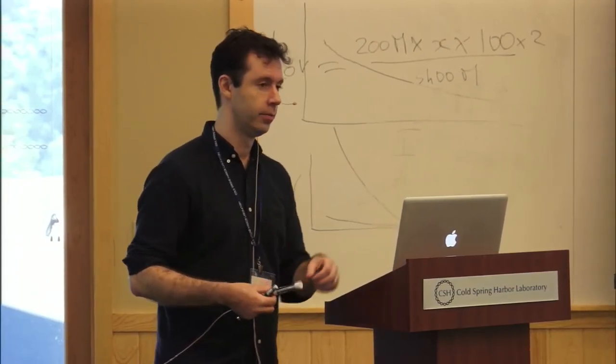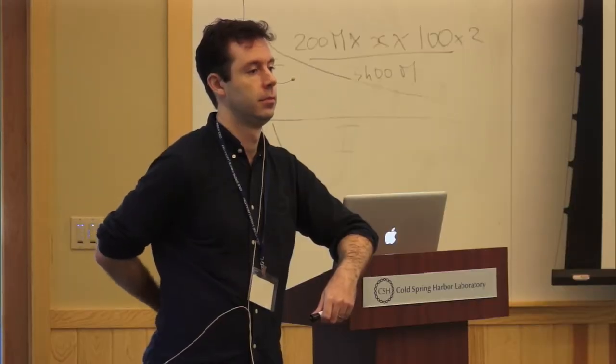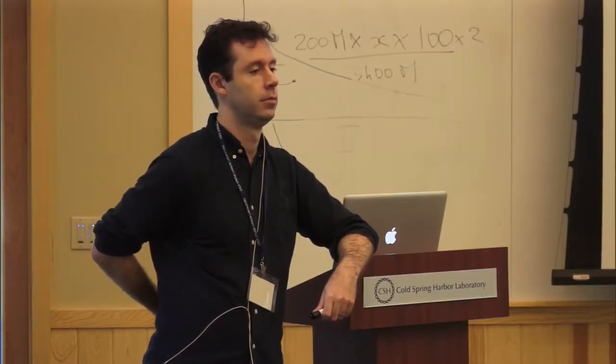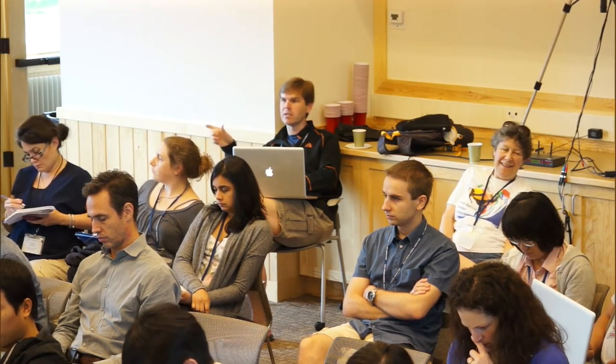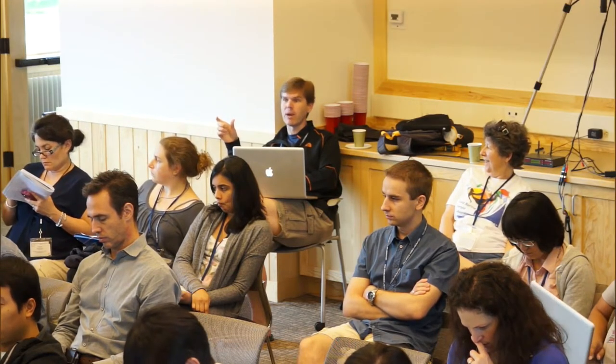But there's one key little piece that some of these aligners do well and some don't, and it's called mapping quality. It ends up in the BAM file. When I first think of mapping quality, I think how well does this read map to its region, that is, how many mismatches does it have? But actually, that's not what mapping quality is. Mapping quality is the probability that I've mapped this read to this location and not someplace else. So mapping quality, if it's implemented correctly, is basically a measure of uniqueness.